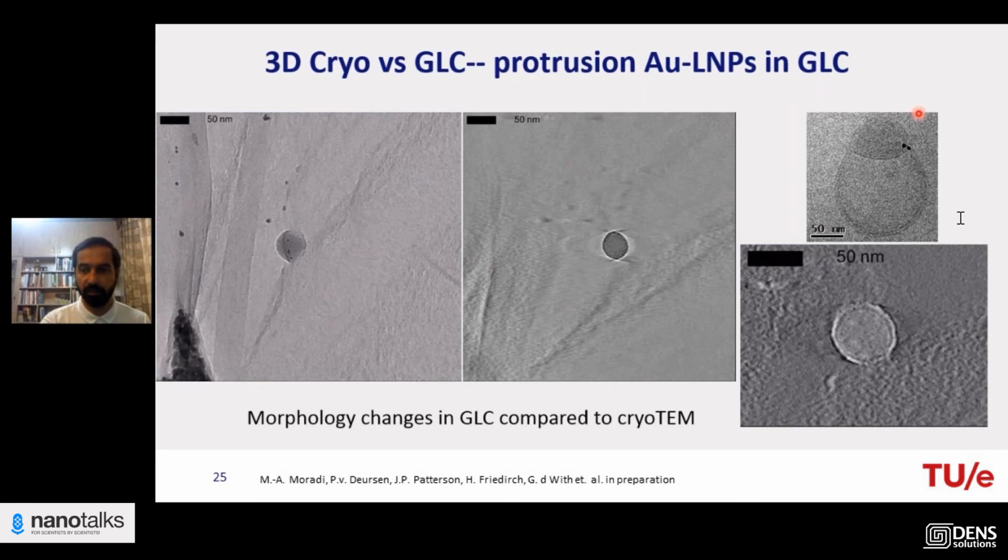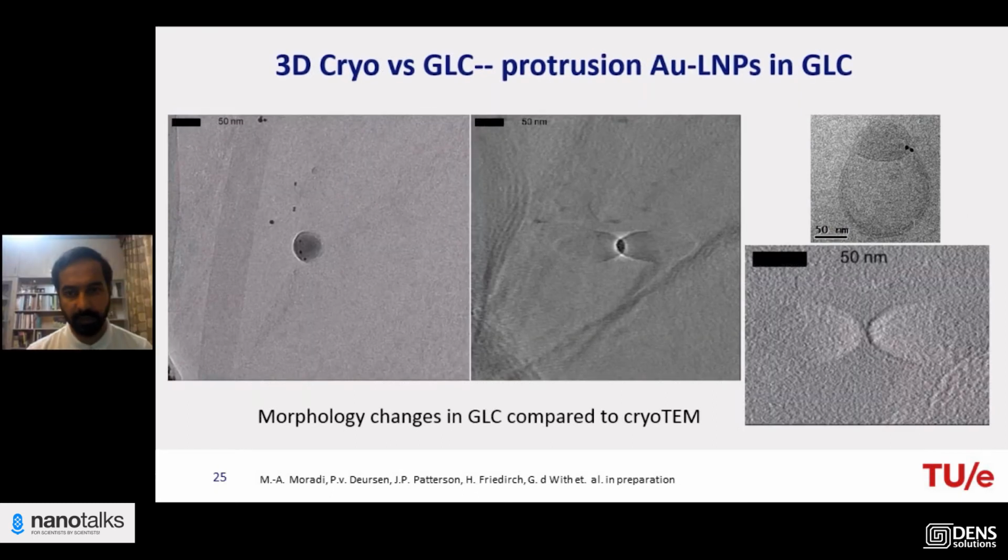data of liposomal particles, which you can see they have been imaged before by cryo-TEM, and it has been successful to get some 3D information and 3D reconstruction, and with some image processing you can see. As I said, one of the things we do is a comparison of the results from graphene liquid cell work with cryo.